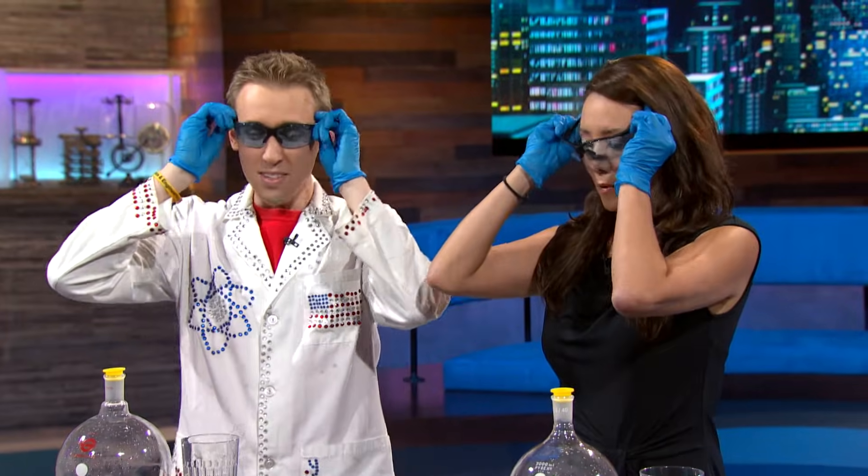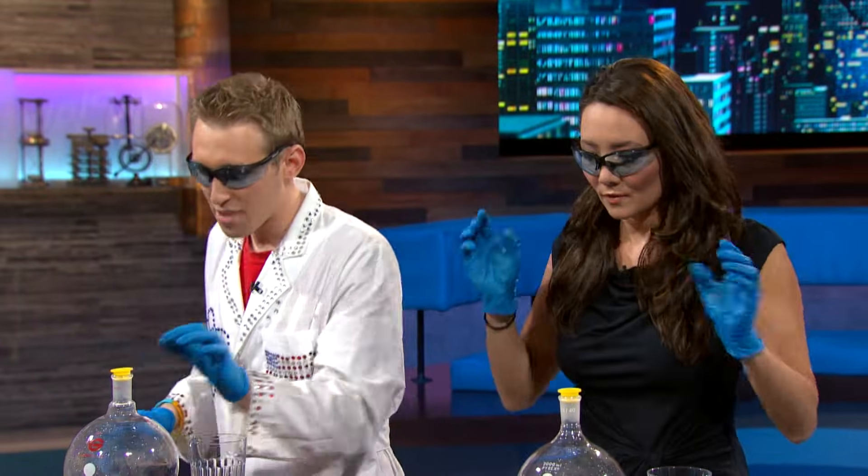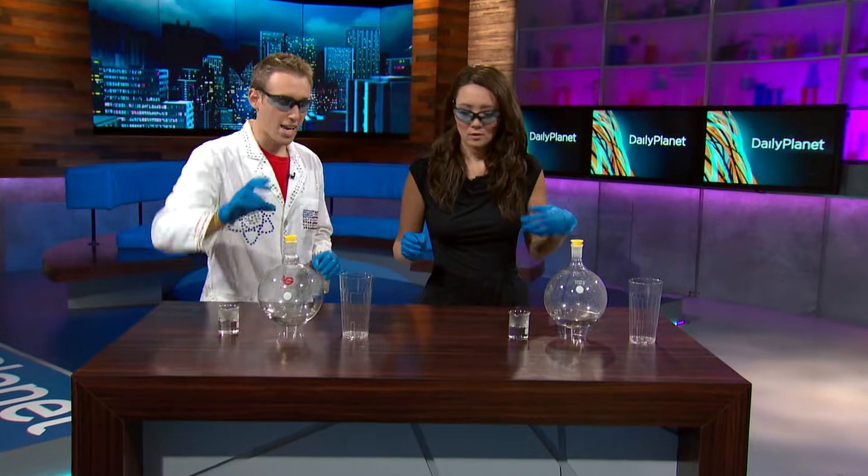Step one: put on the safety goggles. In a second we're gonna take off the yellow cap, quickly pour the sugar water into the dissolved silver, then put the cap back on and shake it so that the liquid covers the entire flask.